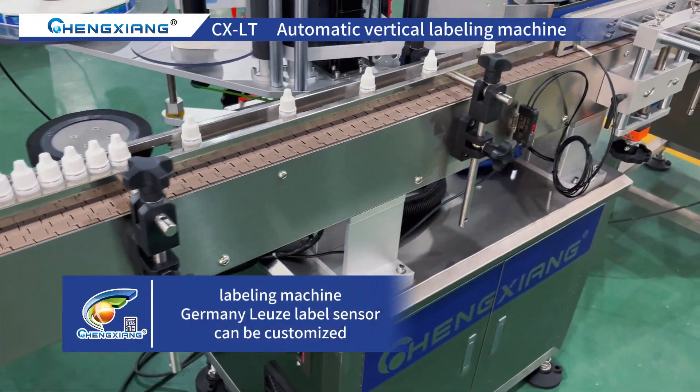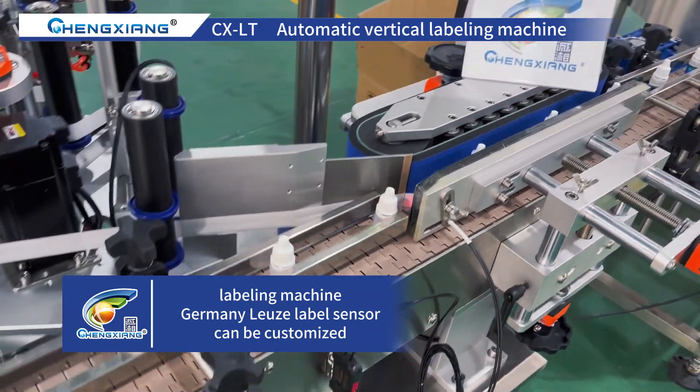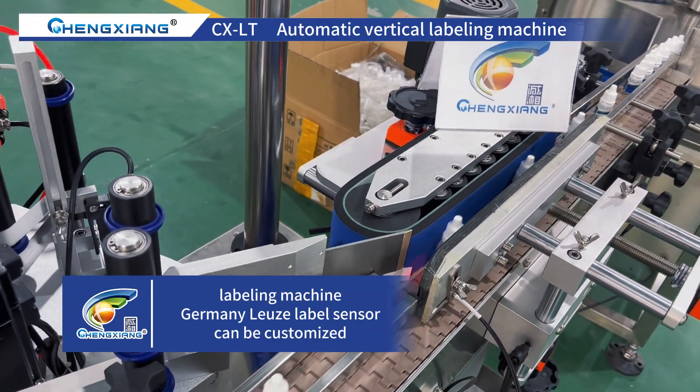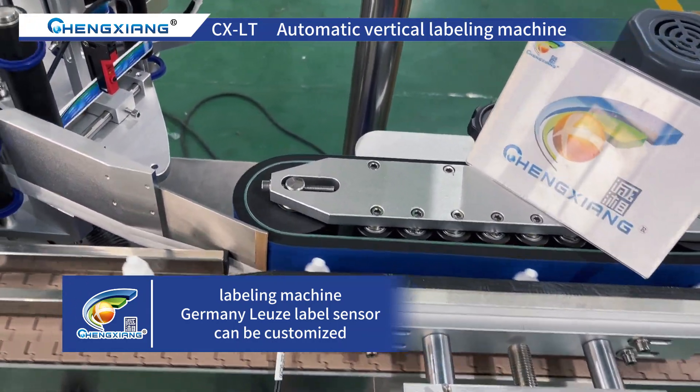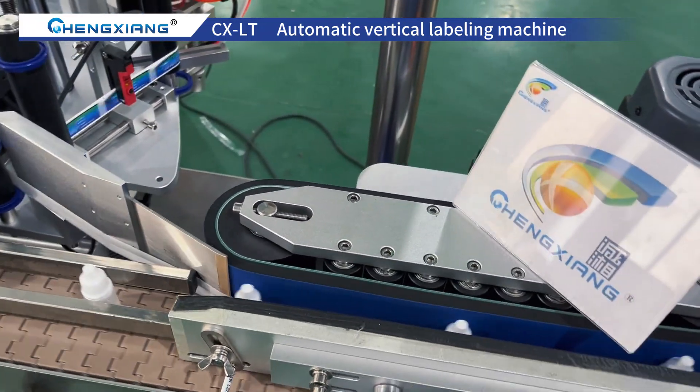This is the labeling machine; it can be customized according to your products. We use the Germany Leuze label sensor, so labeling accuracy is very high. We are also equipped with a date printer, which is optional.